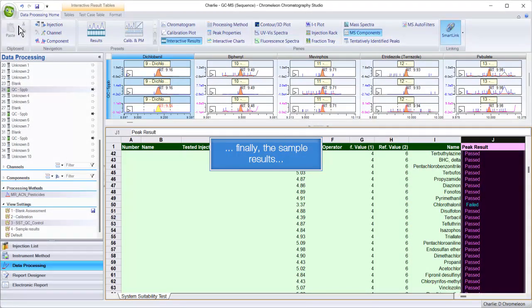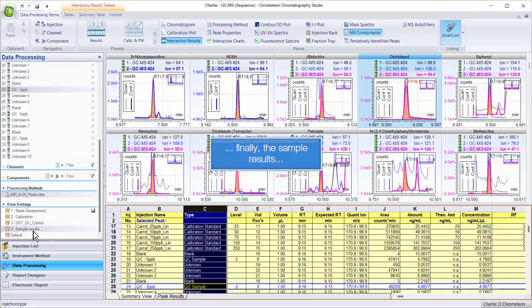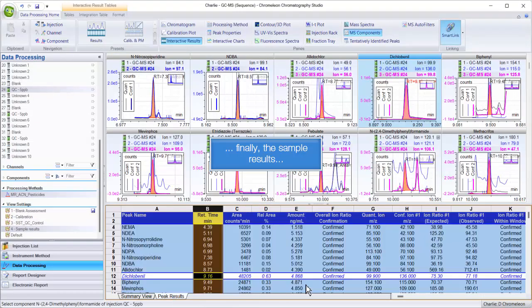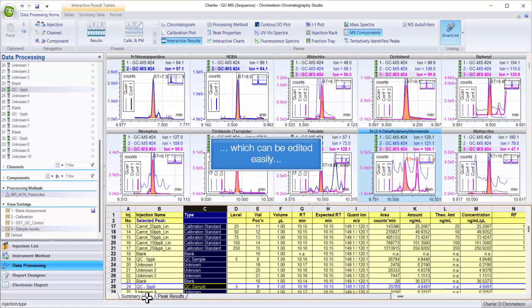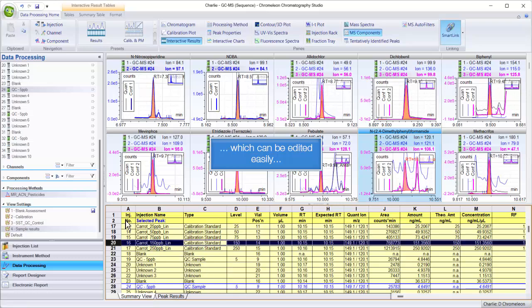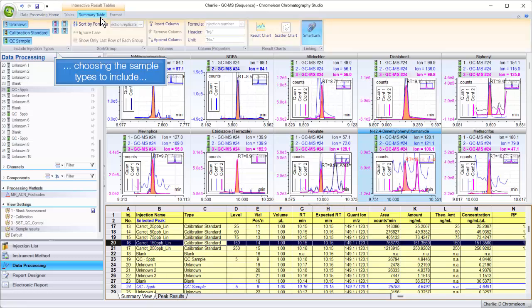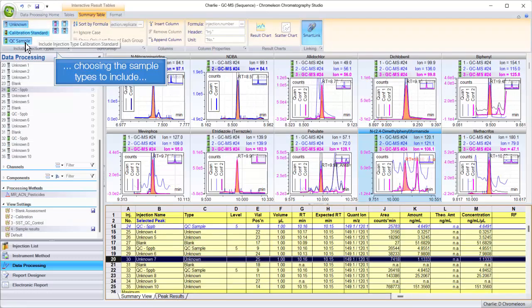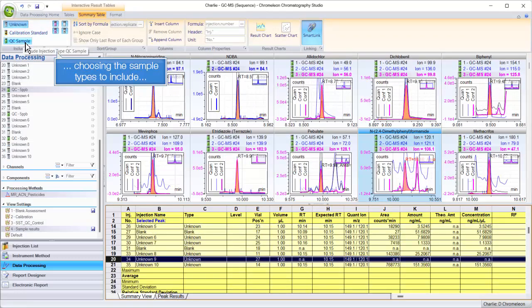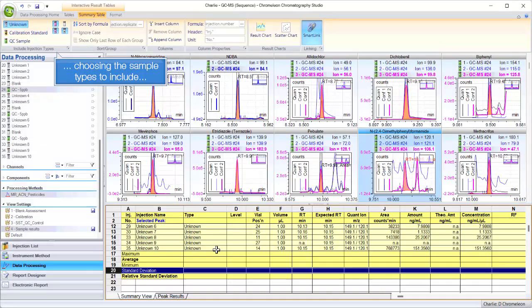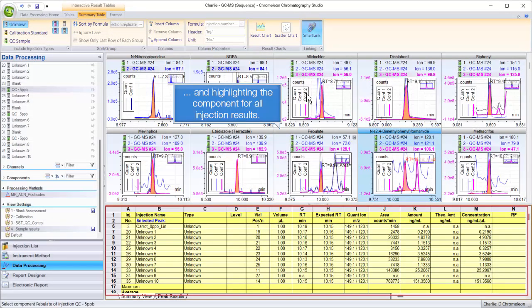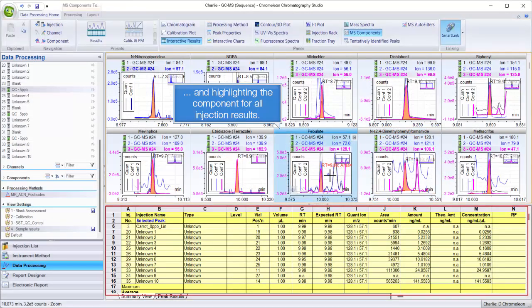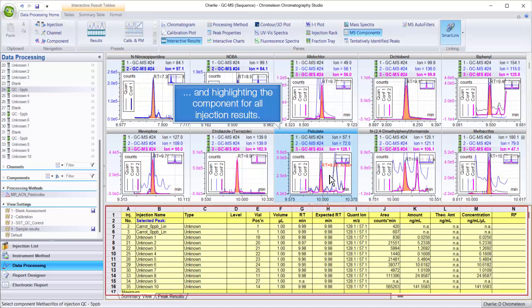Finally, the sample results, which can be edited easily. Choosing the sample types to include and highlighting the component for all injection results.